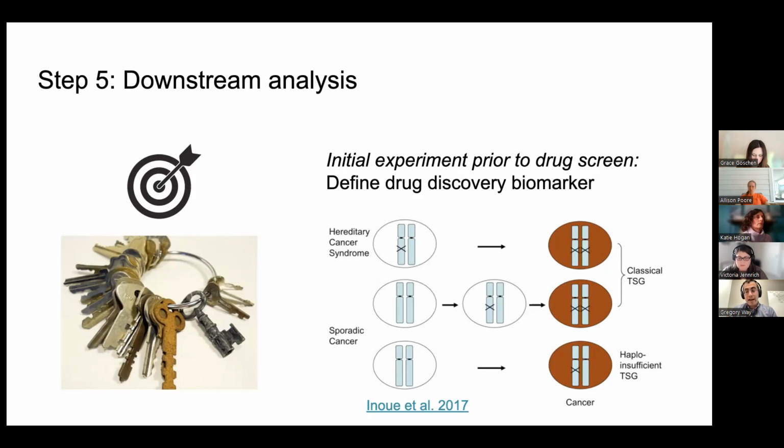And so what we're trying to do actively is to develop experiments to model what haploinsufficiency looks like phenotypically, so that we can perform a drug screen to specifically reverse that phenotype. And I think for these particularly challenging diseases, cancer for instance, that don't currently have cures, really focusing on that phenotypic biomarker is going to do a load of good for making sure that your drug screen actually gets some hits that we want to validate later on.